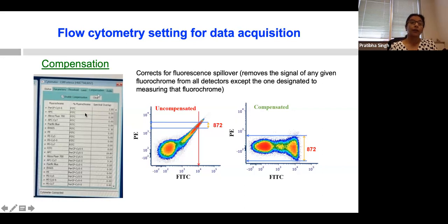And this is the way to remember: whatever fluorochrome you are trying to compensate is on your right hand side, and then the fluorochrome against which you want to fix it, here it is PE. You pay attention here, and start subtracting the values, PE minus FITC. You can increase or decrease the number here, and it will show how the population is changing.